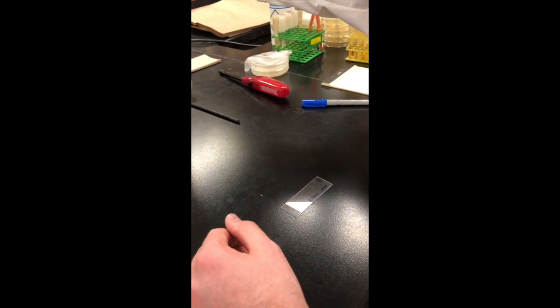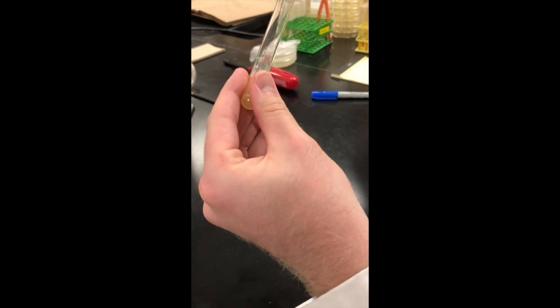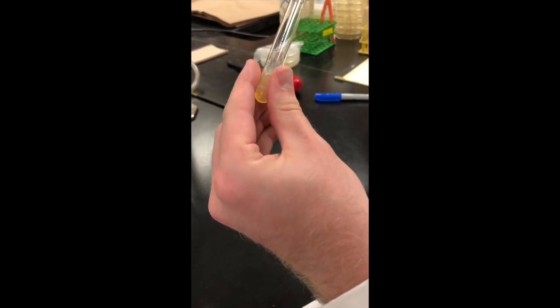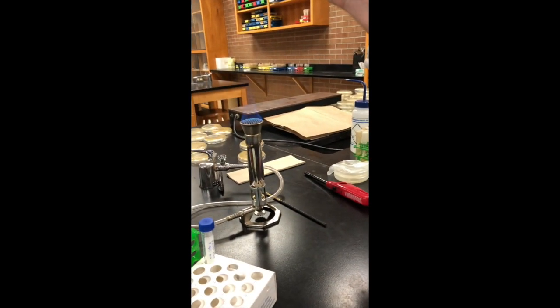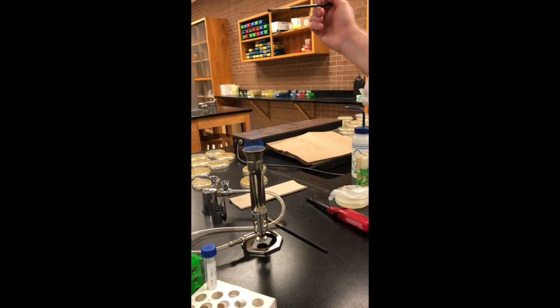So Andrew's almost finished flaming his loop. So now we're going to add the unknown. A little bit. Flame. Tap. Touch our loop to our slide. And then flaming our loop, comfy cozy, holding our loop way up top.